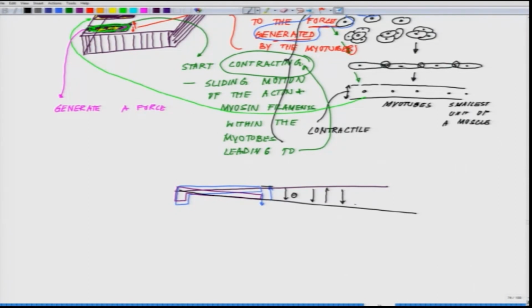If you repeatedly measure this theta angle, most likely it is not going to change, but even if there is a slight change in the theta angle, you average it out, averaging the theta angle.